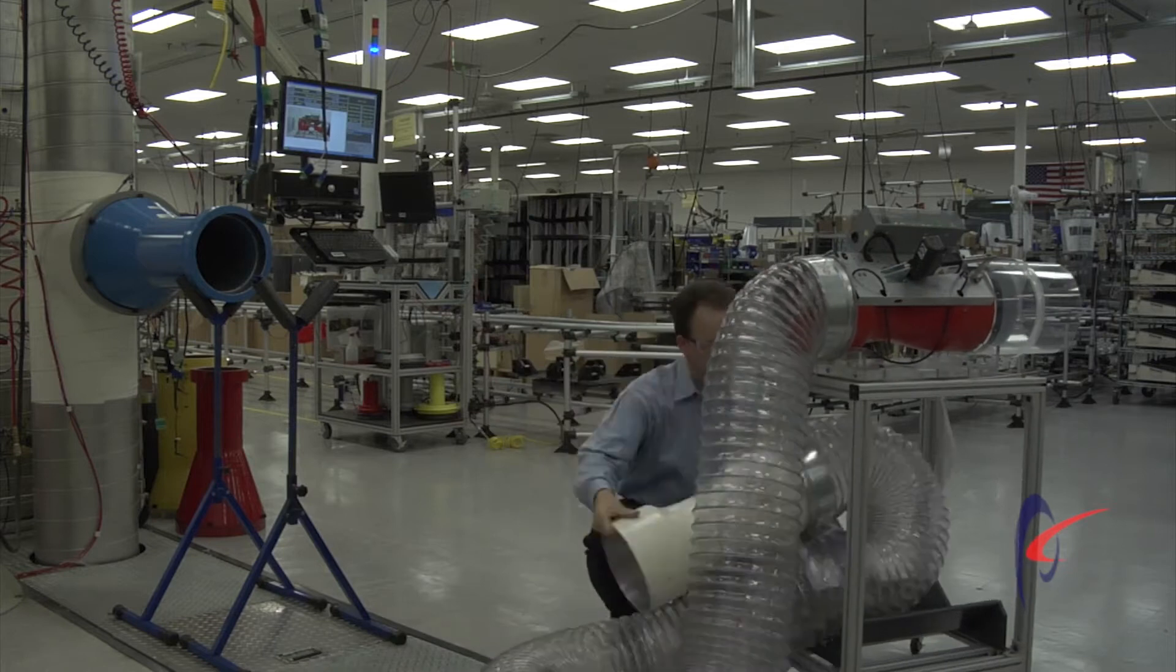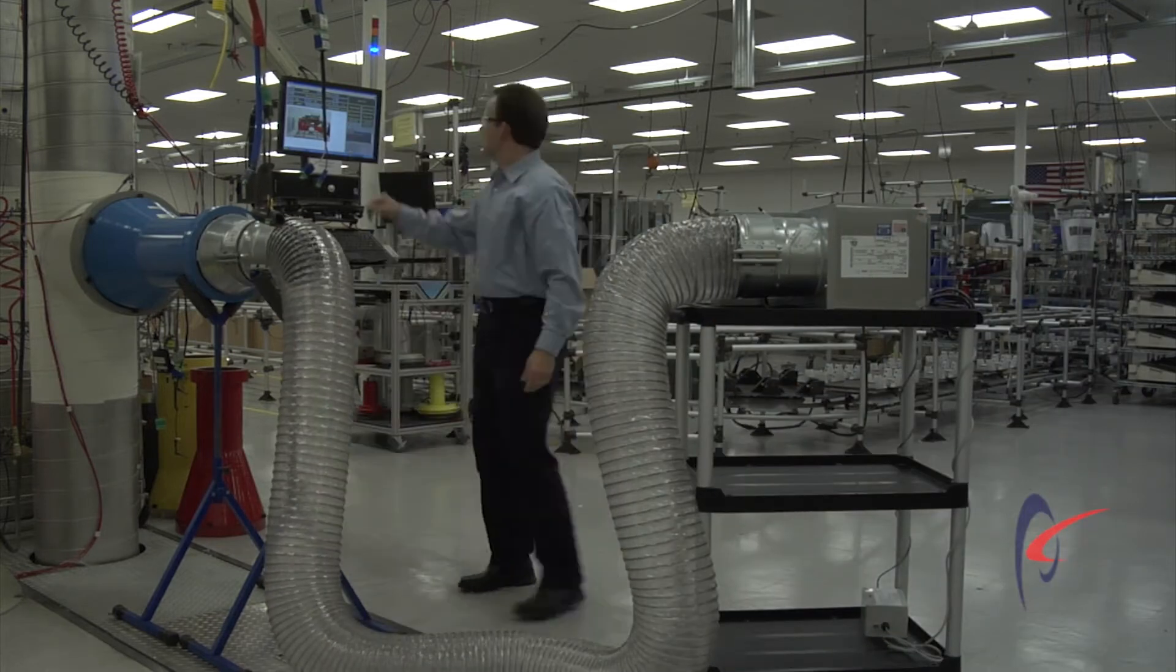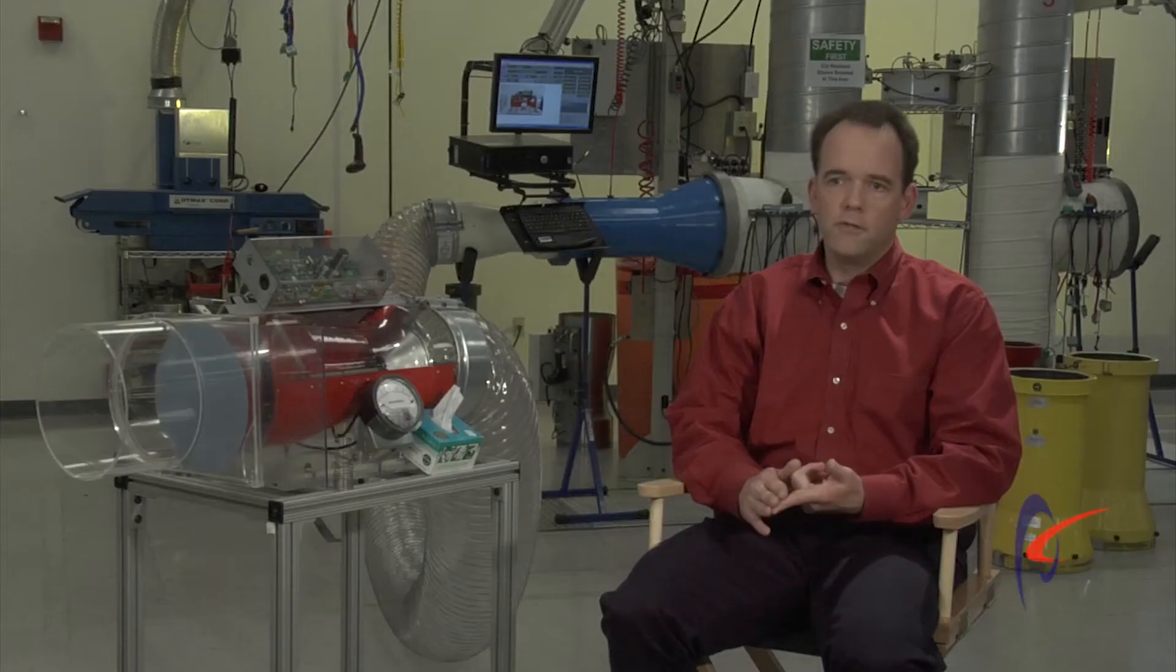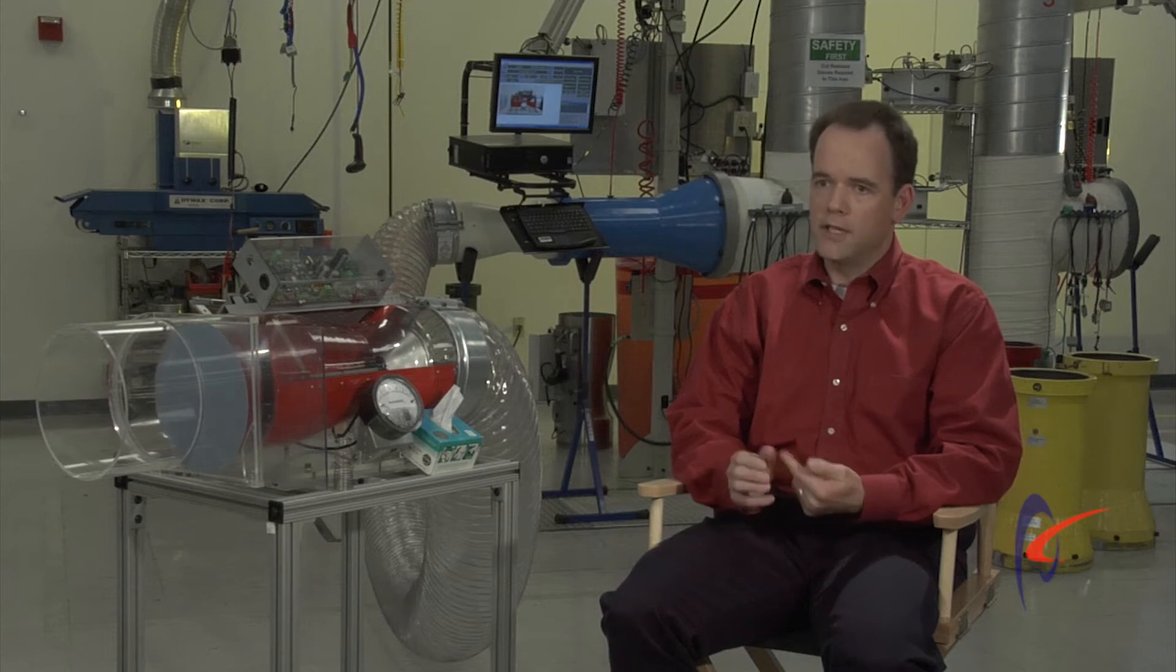When a variable air volume terminal unit is connected to our air station, or VAV box, as it's commonly called, they measure flow. They're not mechanically pressure-independent like the Phoenix valve. Any change in pressure drop is then a change in flow. It has to measure that change. The controller then has to move the actuator. That takes time. You could lose room pressurization. You could lose fume hood containment. There's also inaccuracy with that.